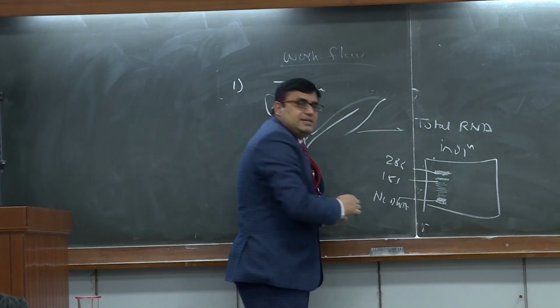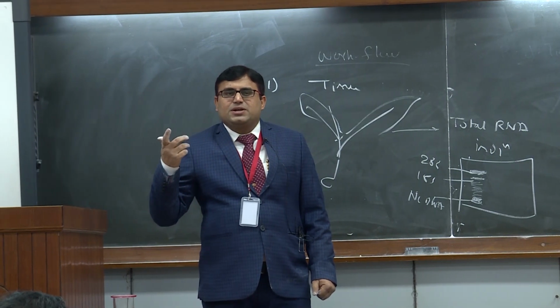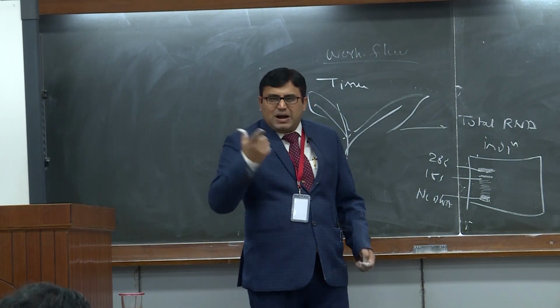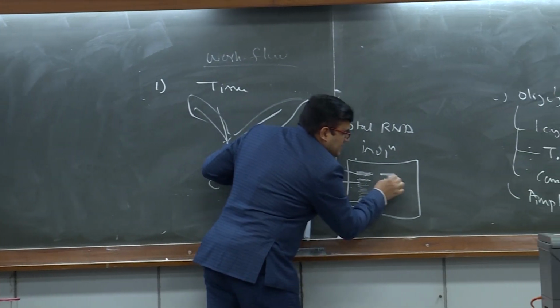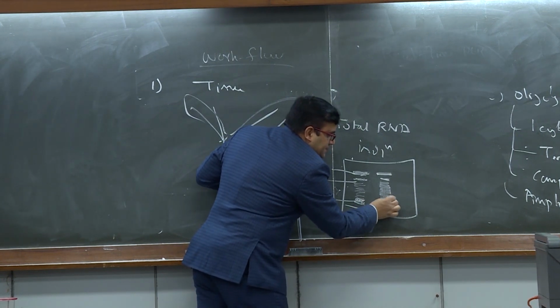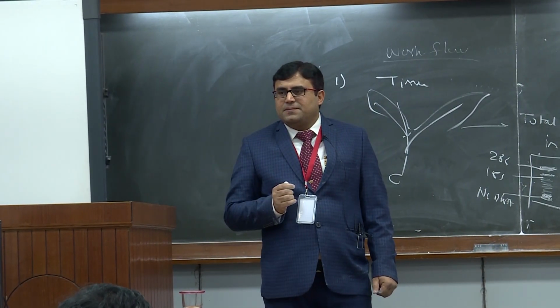This will signify the non-coding RNA, right? Now, many times it happens that if you have not taken precaution, your RNA is partially degraded or degraded. So in case of partially degraded, the result will be something like this. There is a prominent band, there is a small band, then there will be a smearing, and then here you will get a very prominent band. It will be something like this. It means the RNA which you have isolated is partially degraded.